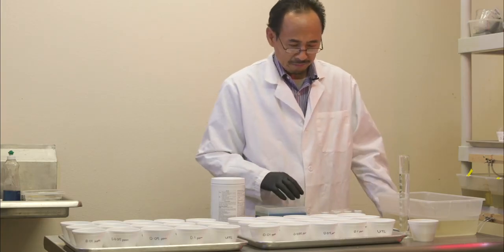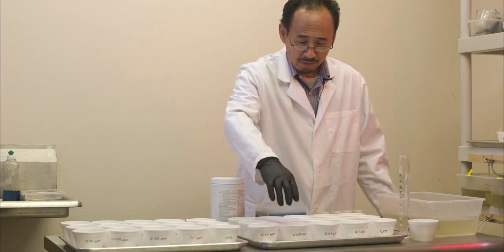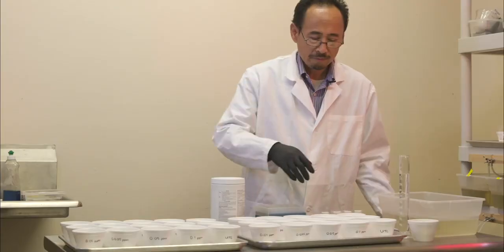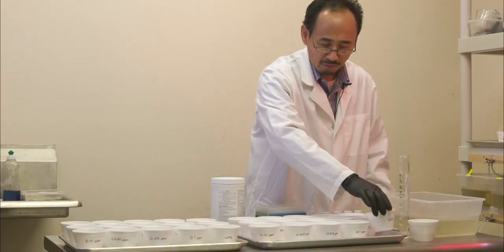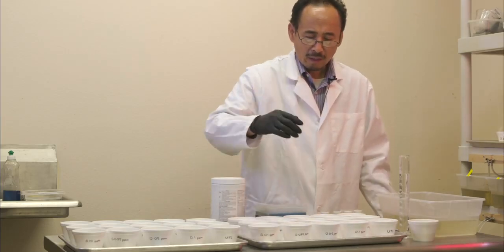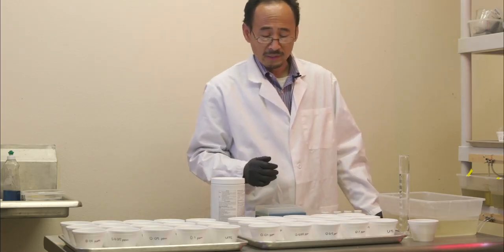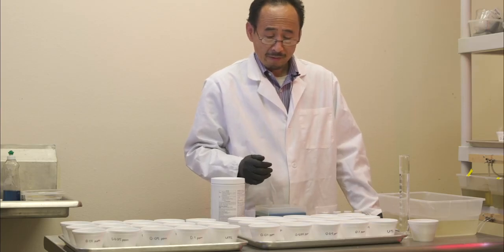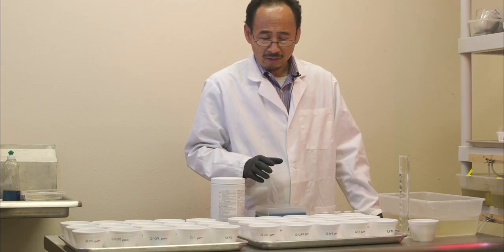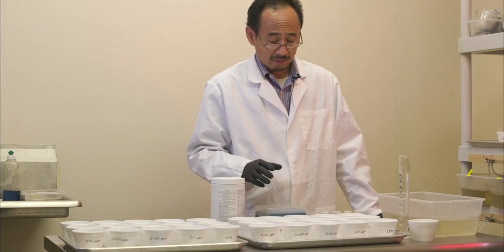Then, as you can see from the cups, there are 4 with different concentrations, and there's one untreated control. So this one labeled as UTC, stands for untreated control. Then you have a different concentration. This concentration, ideally, you want to generate 5 to 95% larval mortality at the reading time. But sometimes it can be a little bit off, a little bit lower, a little bit higher. But as long as you can cover, let's say 80 or 90% of this range, you should get decent results.